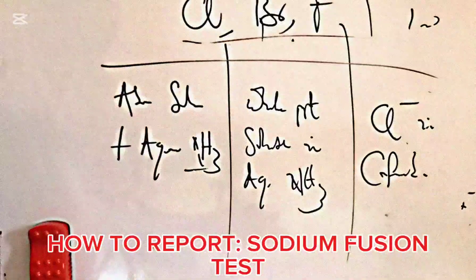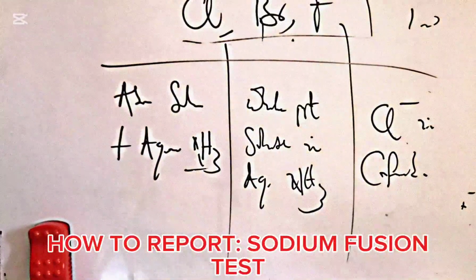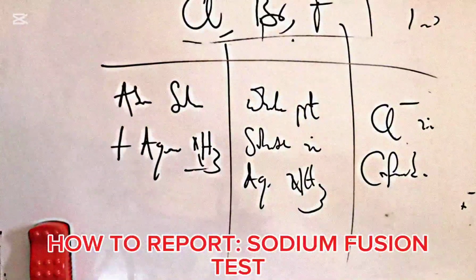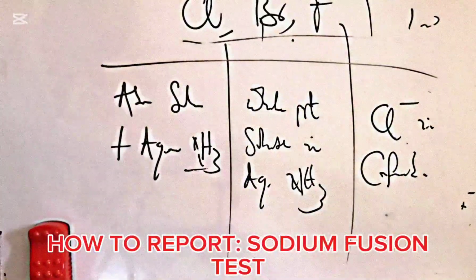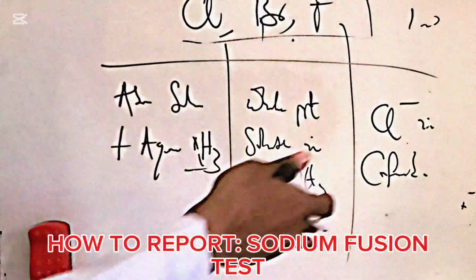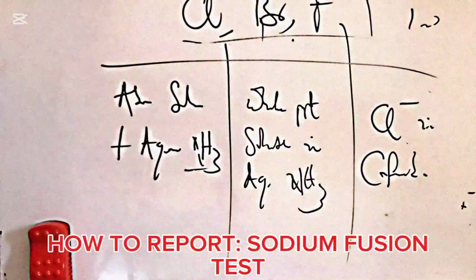It is no longer a thing of if it is present or not, because the previous test you carried out told you that chloride ion is present. So this solubility test is telling you that yes, it is actually chloride ion. So it is confirmed. You see?